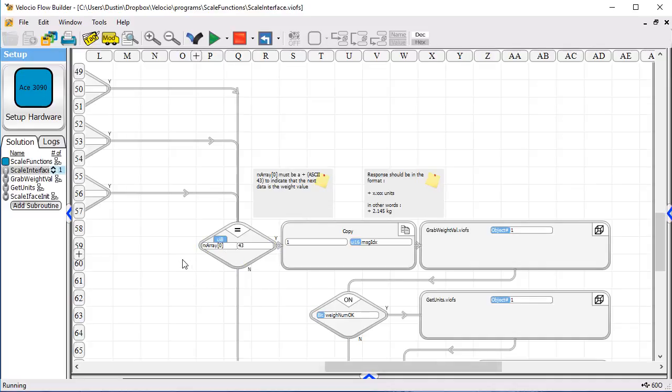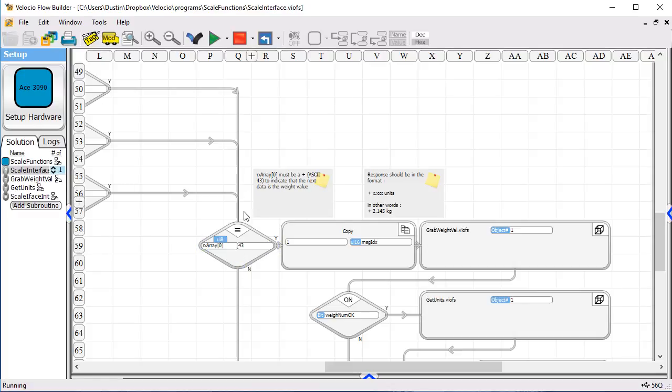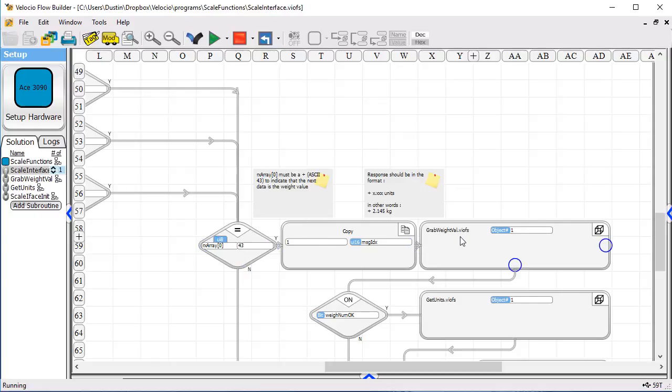The response message from this scale starts with a plus sign, so we check for that. That plus is an ASCII 43. If the message starts with a 43, then we go in and we have some linked subroutines that will go grab the weight. It will read back and decode the ASCII reading for the weight.